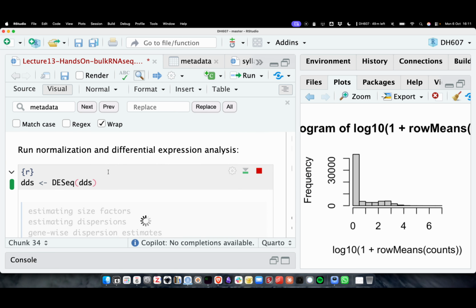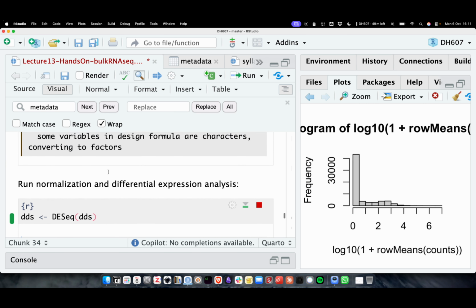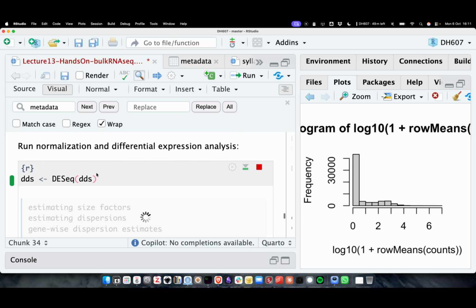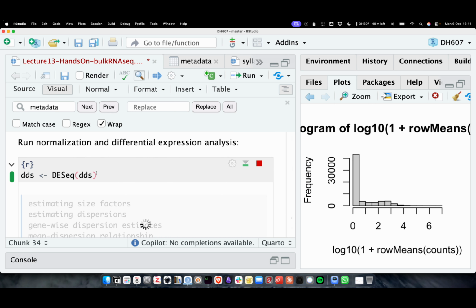So I'm confused, like you showed the graph mean and variance. Which step is handling that? Yeah, good question. We'll show you in just a bit.